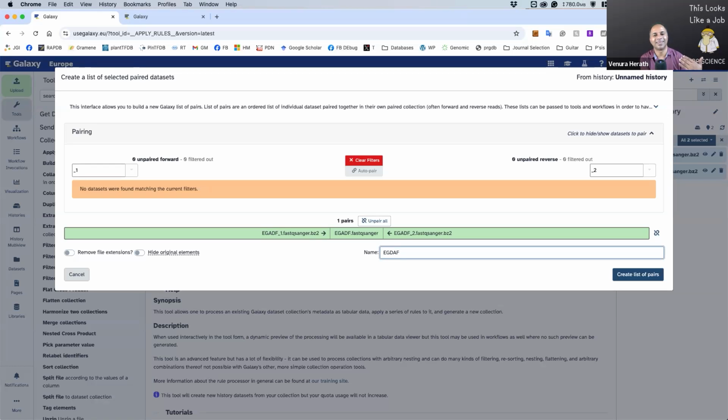Because this will be a learning experience for me as well, because I don't use Galaxy. I use bash scripts to run all these tools. But this is the one we all have access to now. So therefore, I only use Galaxy for educational purposes. And one day you will use either Galaxy or the more coding-style supercomputing or high performance computing approaches.